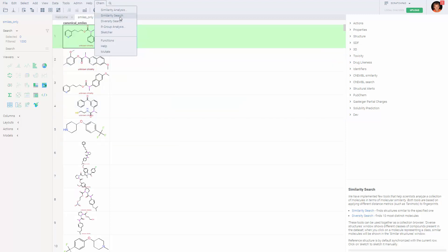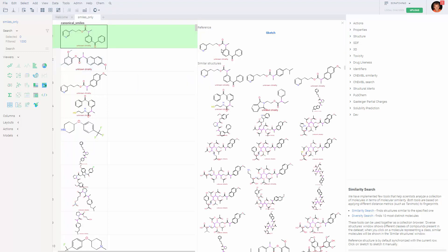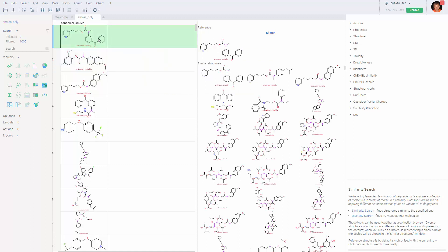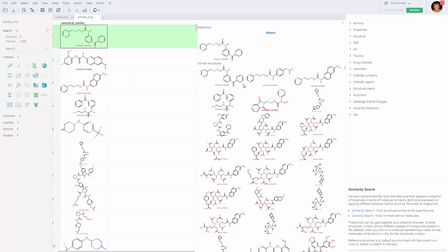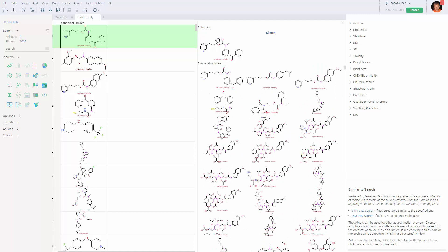To launch the similarity tool, go to Chem Similarity Search. A reference molecule appears, which by default is synchronized with the current record. And then, in the list below, you'll see molecules similar to the reference one sorted by the similarity score.